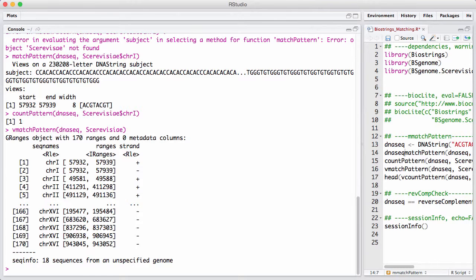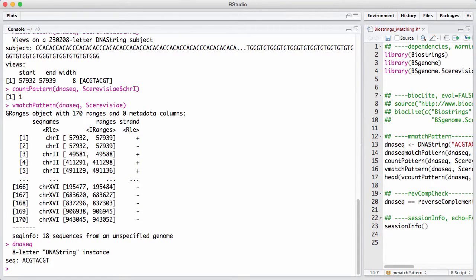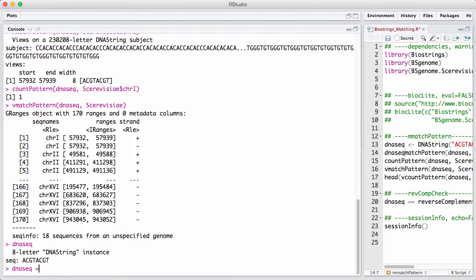Secondly, we see in the output that for every hit on the forward strand, we have a hit on the reverse strand, and that seems a little weird. That turns out because we have a weird sequence. The DNA sequence we are searching for turns out to be its own reverse complement.